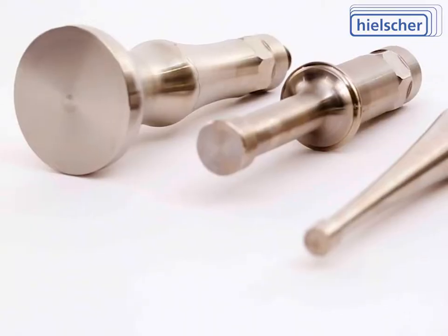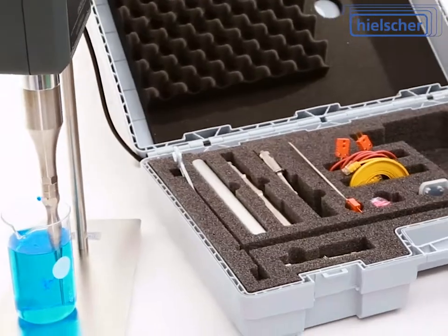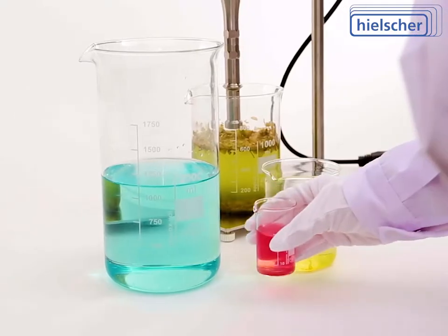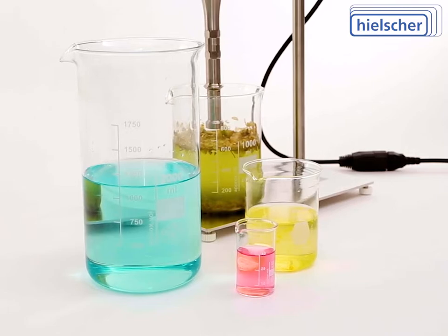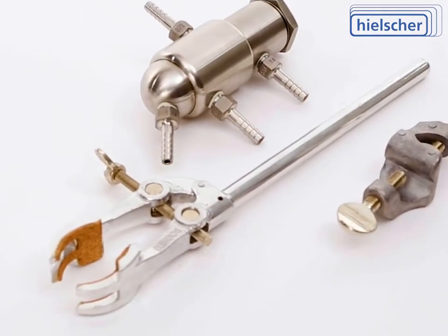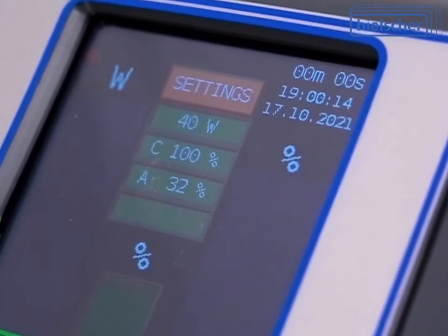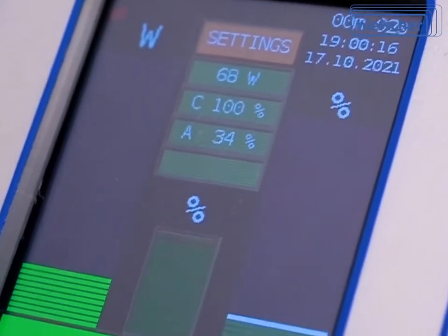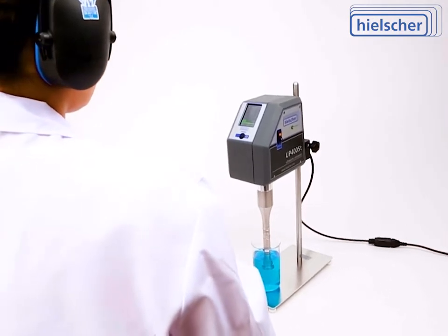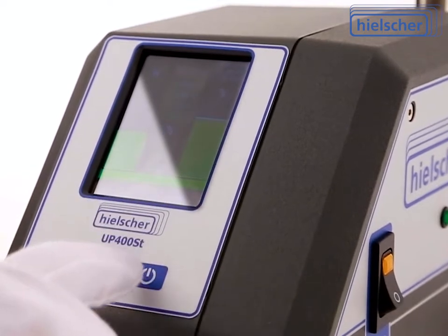In combination with a wide range of sonotrodes and accessories available, it's optimized exactly for your sonication needs. Sonotrodes are available for various applications and volumes from 2 milliliters through 8 liters or 4 gallons. Flow cell reactors made of glass or stainless steel with a cooling jacket can be used for continuous inline sonication. The sonication intensity of Hielscher's UP400ST is up to 1,000 times higher than that of an ultrasonic bath or cleaning tank. Our professional technical team will be glad to recommend the most suitable setup and sonication protocols.